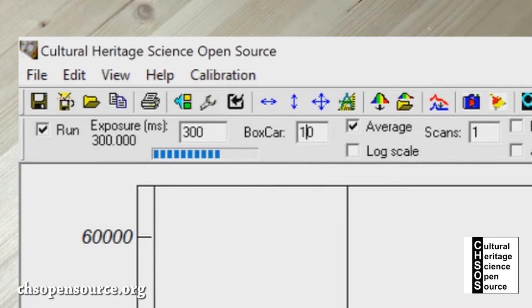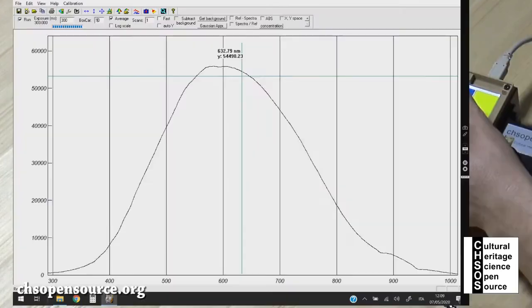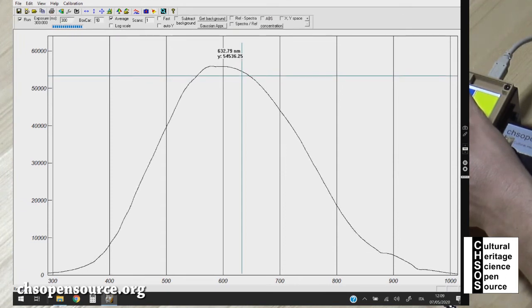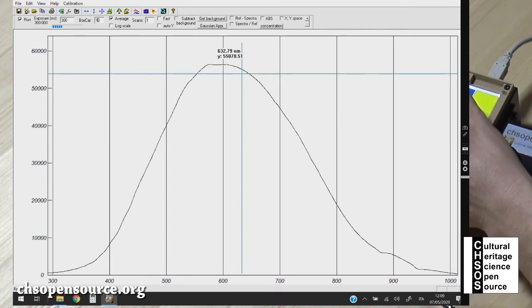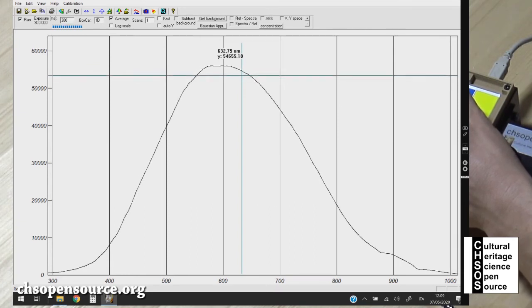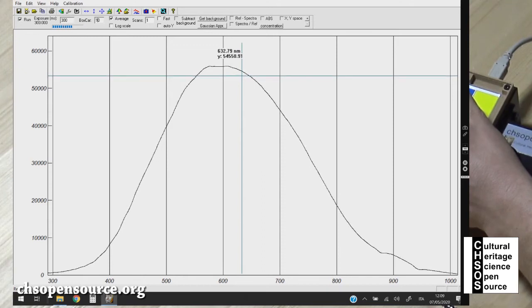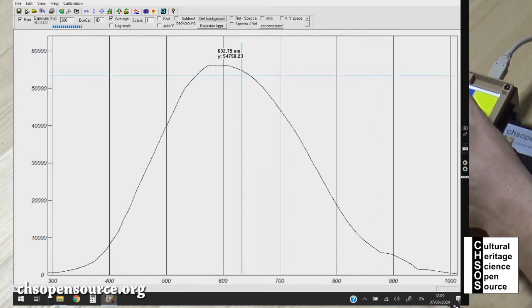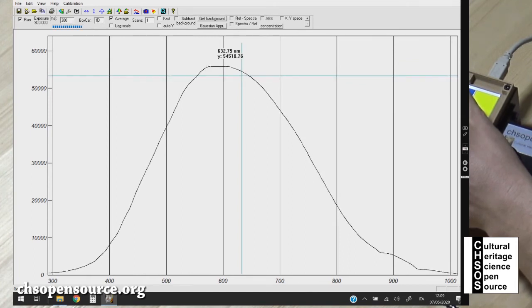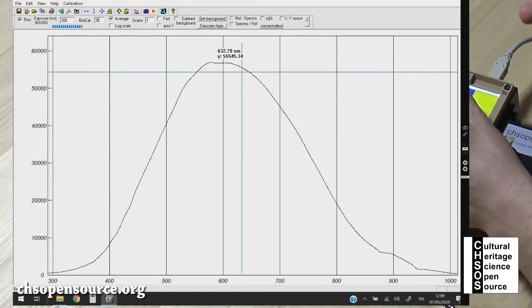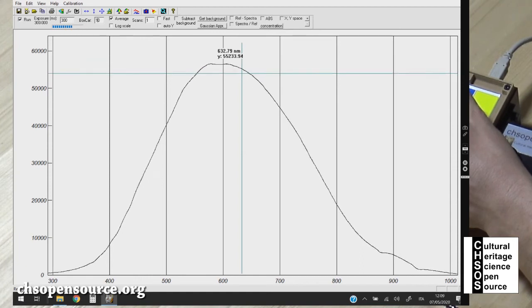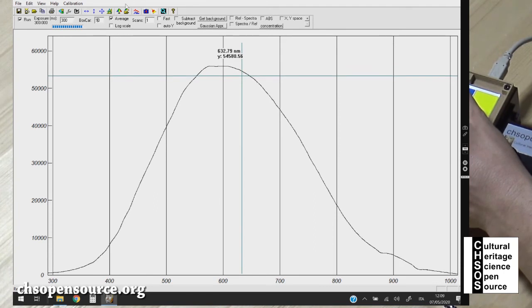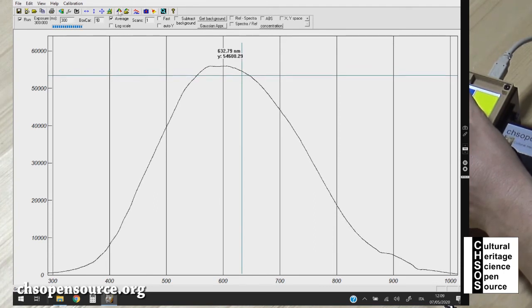The maximum of this curve is between 50 and 60, so this is the perfect condition because 60,000 is where the system goes saturated, which creates a problem. We want to have it below 60,000. So our exposure in milliseconds will be 300.